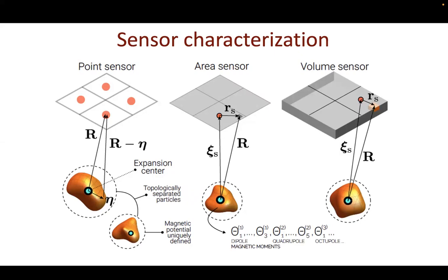We have a thickness, and here it's depicted as almost flat, but if you reckon that your pixels are 1 by 1 micron and that layer of NV centers is a micron thick, then your sensors are actually almost cubes, so they're not that flat. Also, this gives the opportunity, which was briefly touched upon by Eduardo, to include the full axis of your QDM instead of just the Bz projection, because for the volume integral it doesn't matter. So we have to be careful with characterizing our sensors.